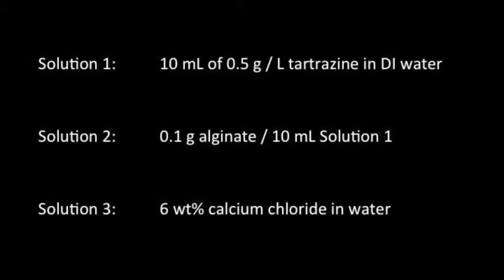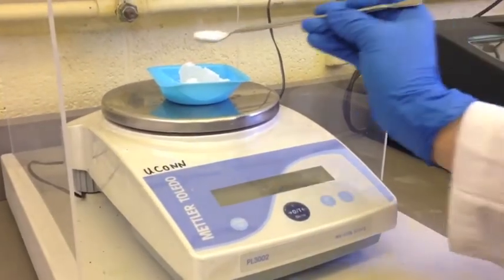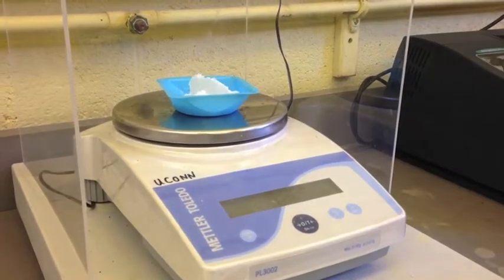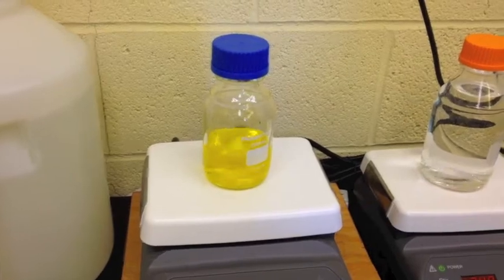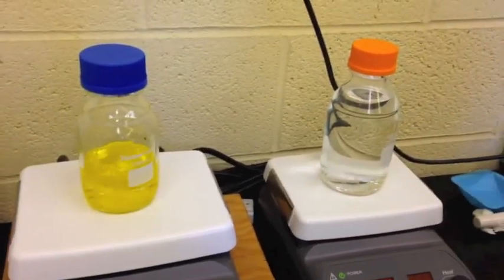First, the solutions shown were prepared to be used in the production of hydrogel beads. All solid components were measured out in a weigh boat and poured into a 500-milliliter bottle with their respective solvents. The solutions were placed on a stir plate and left to mix over the next couple days.